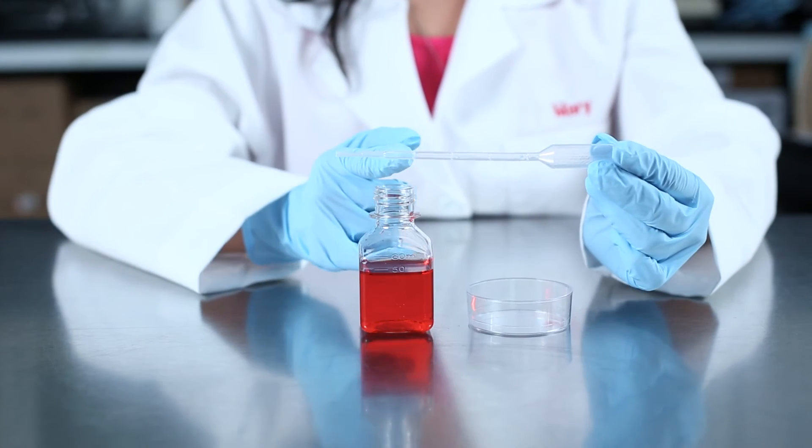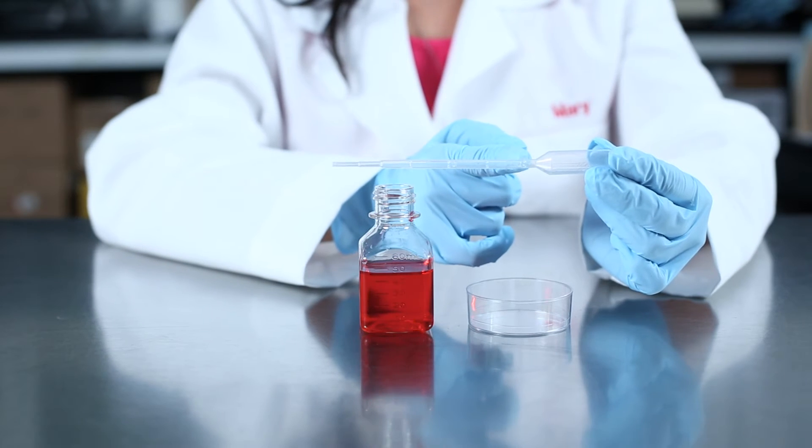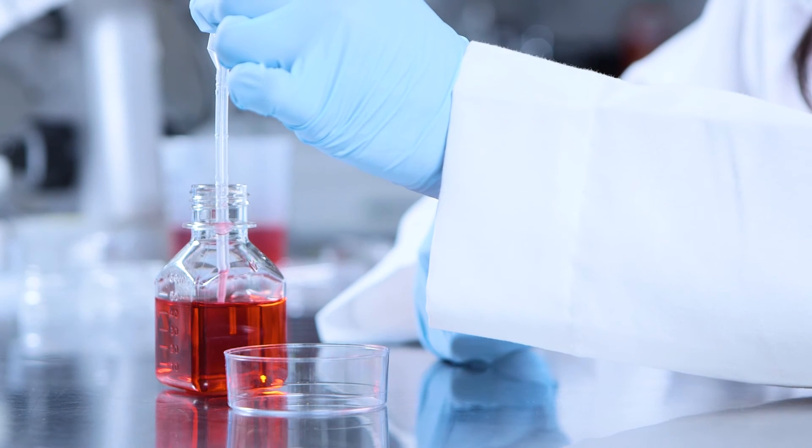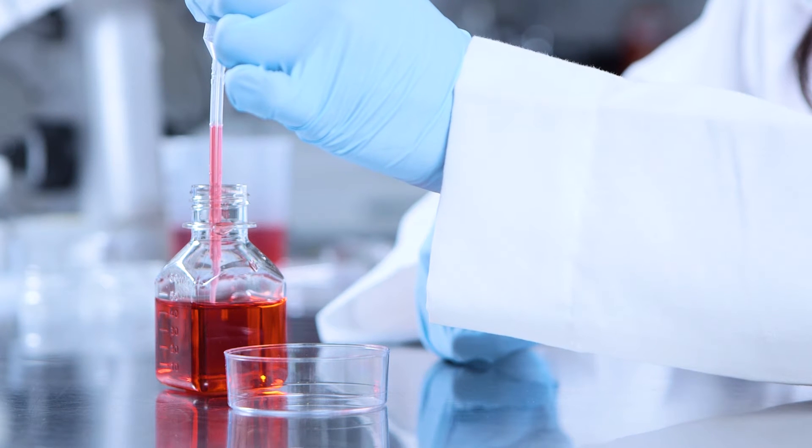We also offer graduated pipettes with various graduated volumes molded into the stem. The graduations allow the end user to transfer precise volumes of liquid.